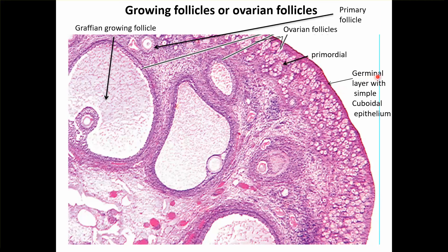The lining is the germinal layer with simple cuboidal epithelium. Very close to it, all the small follicles are called primordial follicles; the little larger ones are primary follicles; and these will be the secondary follicles. This area represents the cortex which has follicles, and this area is the medulla which has blood vessels, connective tissue, and lymphatics.